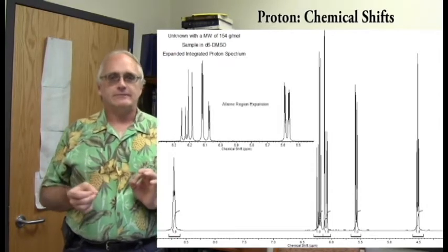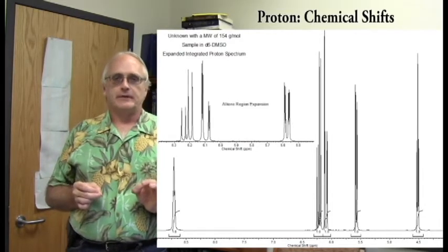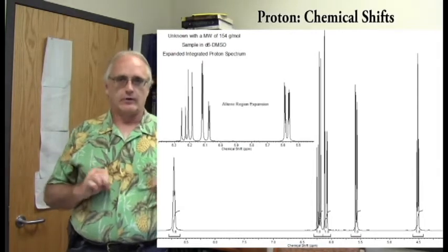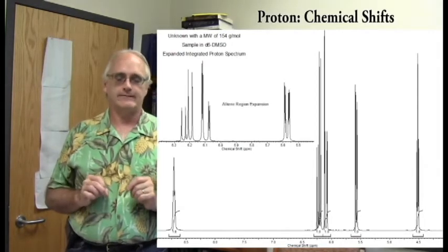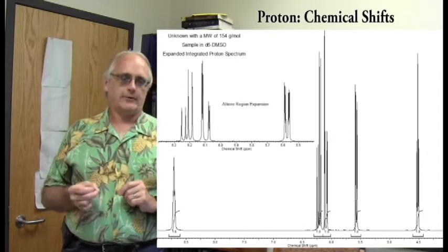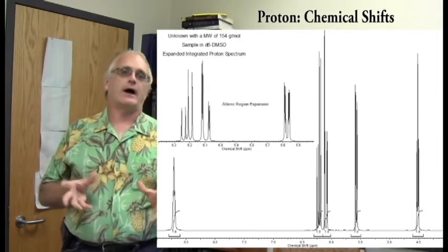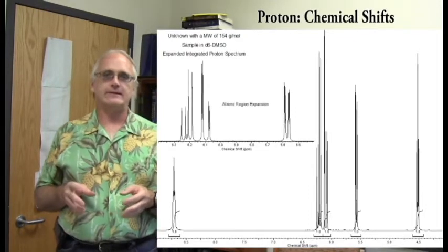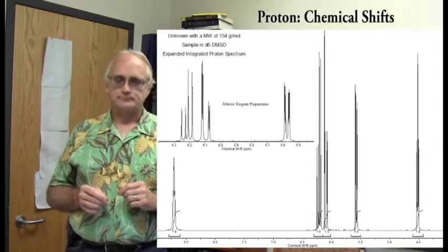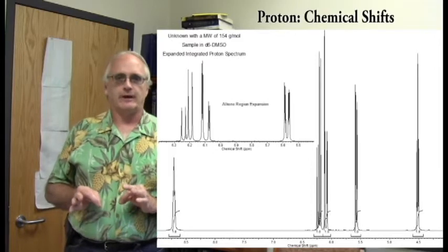The chemical shift first made me think about an aromatic ring, because they can be 7 to 8 and sometimes going up higher than that. It can be kind of variable. But there's only, it seems, 1 proton down here. We're not getting the 4 with 2 substitutions or 5 with 1 substitution on a benzene ring that we've seen plenty of times by now. And so we're going to be on the lookout when we look at the carbon spectrum.